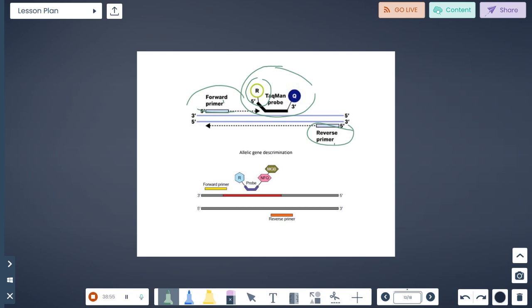And this is actually costly. So because of that, people are also using SYBR Green. This SYBR Green is like ethidium bromide, which you use for gel staining. When the PCR product, double stranded DNA, is accumulating, the SYBR Green will intercalate within the double stranded DNA. So when more PCR product is formed, the fluorescence will increase from the SYBR Green, and you can quantitate it. So TaqMan probe and the SYBR Green reagent are mainly used for quantitating the PCR product.